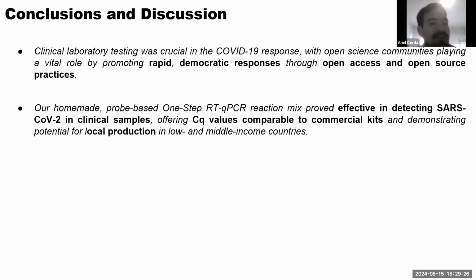Our homemade probe-based one-step RT-qPCR reaction mix has successfully detected SARS-CoV-2 in clinical samples, delivering Cq values on par with those of commercial kits. This highlights its potential for local production, especially in low or middle-income countries, making it a practical solution in resource-limited settings.